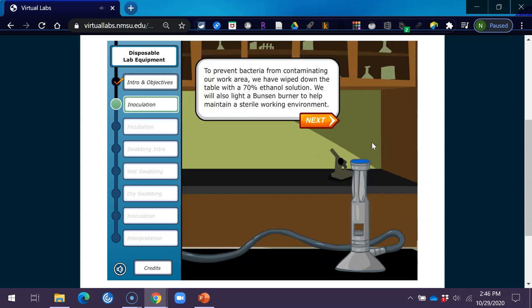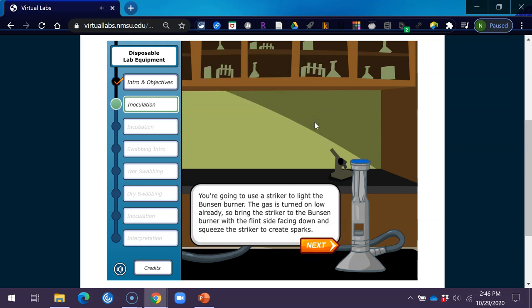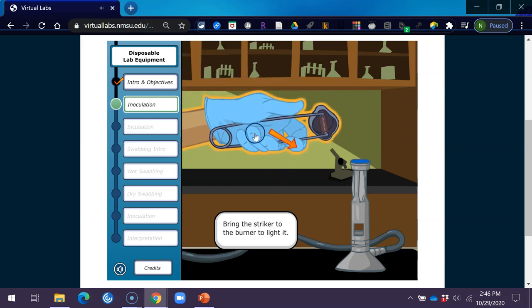To prevent bacteria from contaminating our work area, we have wiped down the table with a 70% ethanol solution. We will also light a Bunsen burner to help maintain a sterile working environment. Use a striker to light the Bunsen burner — the gas is turned on low already. Bring the striker to the Bunsen burner with the flint side facing down and squeeze the striker to create sparks, then bring it to the burner to light it.